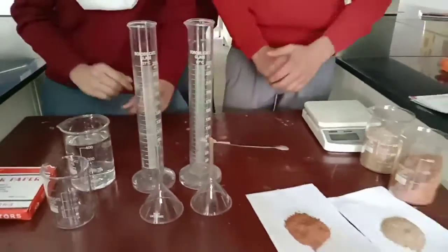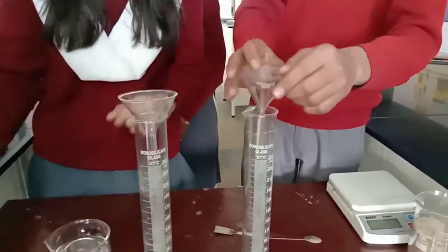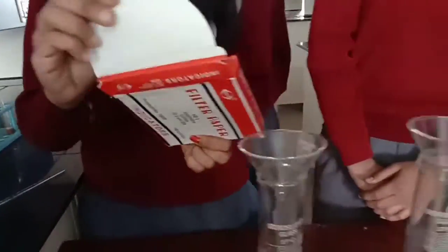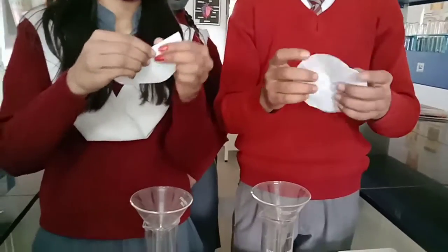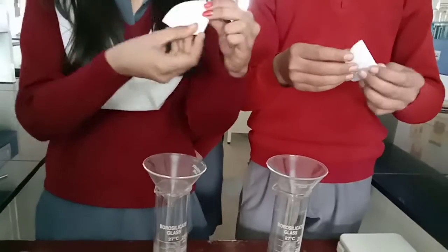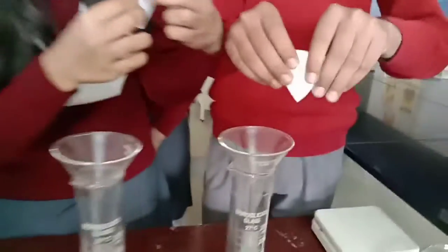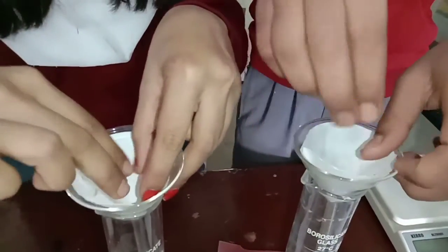We'll take a measuring cylinder and put the funnel on top of it like this. After that, we'll take the filter paper, fold it properly like this, make a cone of it, and keep that on the funnel.